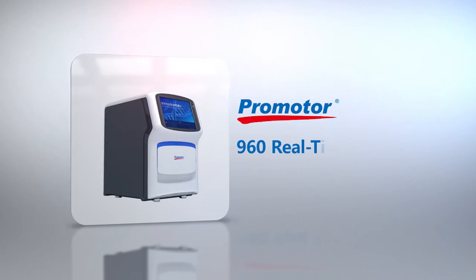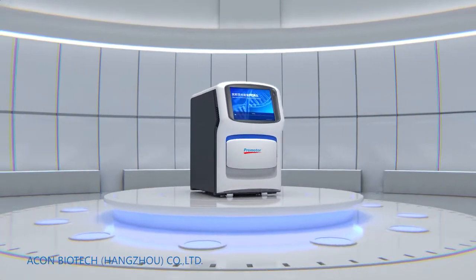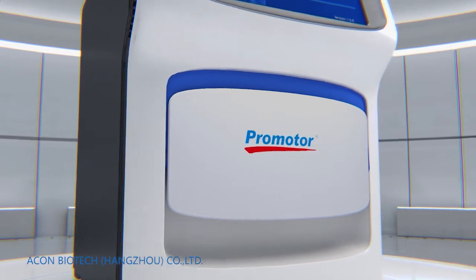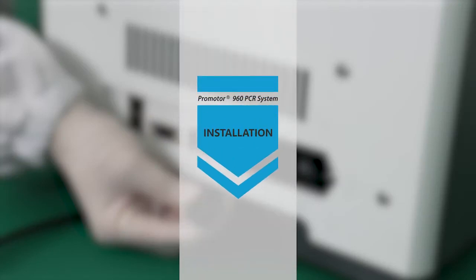Promotor 960 real-time PCR system. Installation.